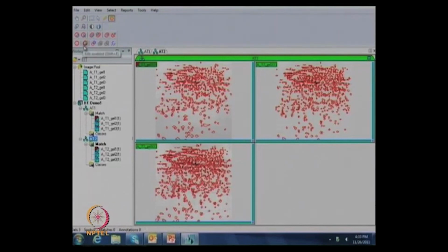In the same way, you can go through each individual gel by zooming and 3D view, and select which are spots and which are not spots. Then you can directly match them. Now I'm doing the same matching. 1274 matches have been done. So these gels are more reproducible as compared to our control. You can see there are no vectors even without giving a landmark. So this is a very fine gel, and the replications we did are confirmed. These replications are okay.